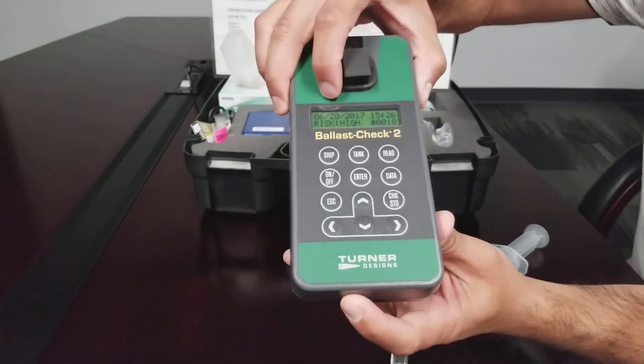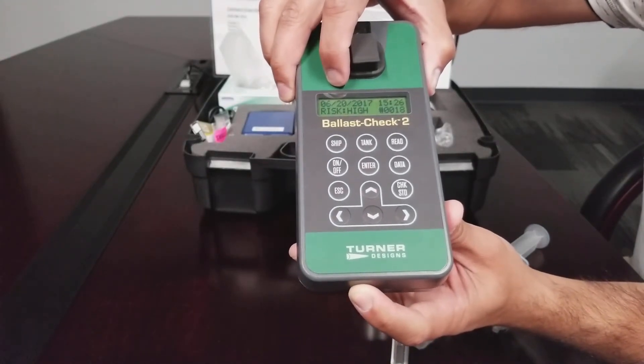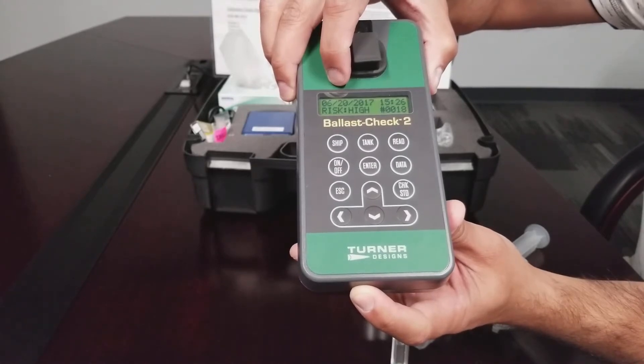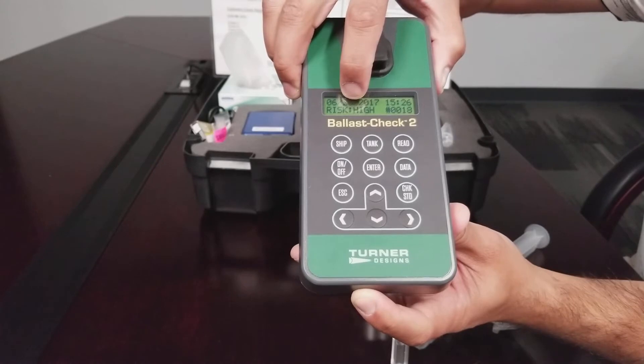Results will be displayed on the screen and logged to memory to be downloaded at a later time. Risk, an indication of exceeding the discharge standards, is displayed on the screen as low or high. In this case, the risk is high.